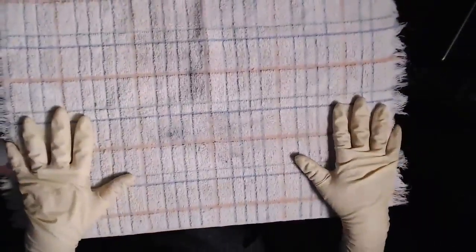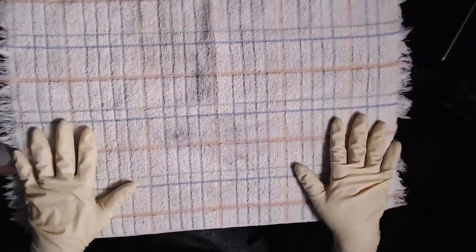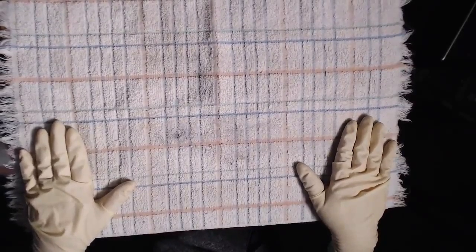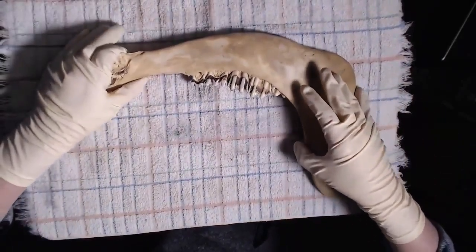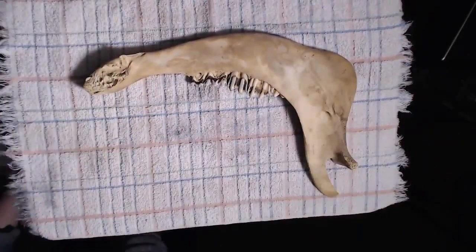Now, if you don't have a cow jaw, don't worry. You can just follow along with what we're doing here. If you do, go ahead and follow along with me in completing these steps.